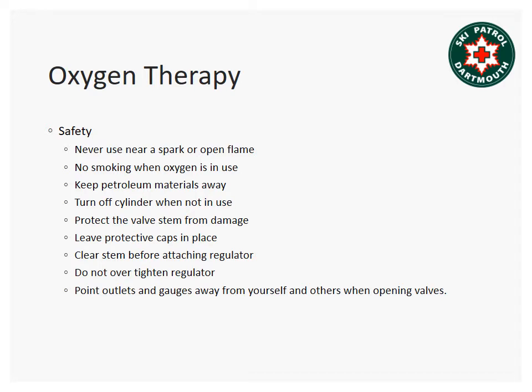When we're using oxygen, we want to be mindful of certain safety factors. First of all, it does support combustion and will make any fire or flame that it comes in contact with much worse. In contact with petroleum oils or other materials, it can spontaneously cause ignition. And it's a gas delivered in a cylinder under high pressure. If you break the top off and the cylinder goes flying across the room, it will definitely break things and hurt people. Keep the outlets and gauges on the regulator pointed away from yourself when opening valves on the cylinder.